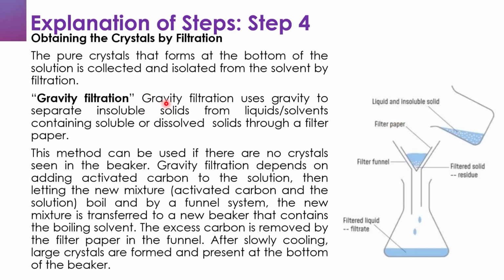Now, what you have to note is that gravity filtration uses gravity to separate insoluble solids from liquids or solvents containing soluble or dissolved solids through a filter paper. And this method can be used if there are no crystals seen in the beaker.